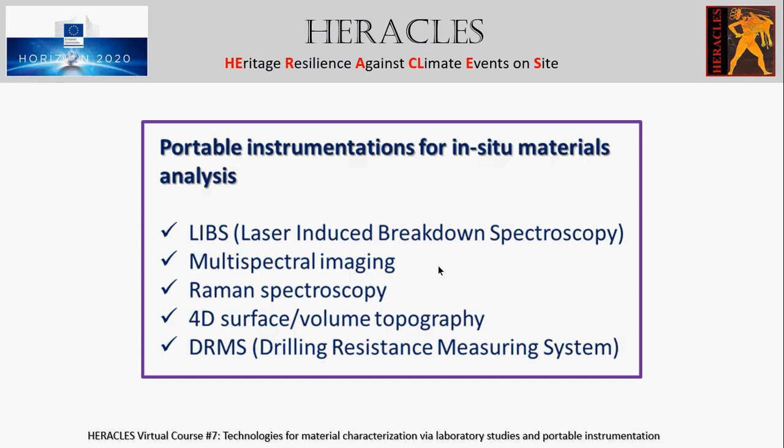This portable instrumentation for in situ materials analysis will be the object of study of part 3 of this virtual course number 7.